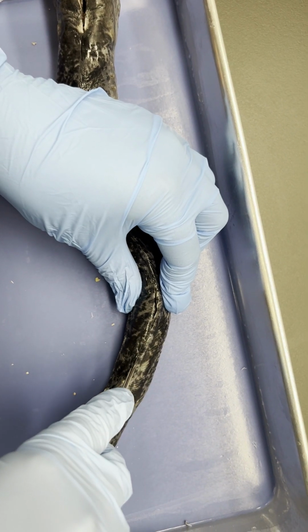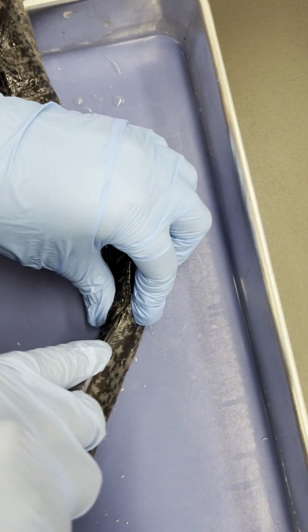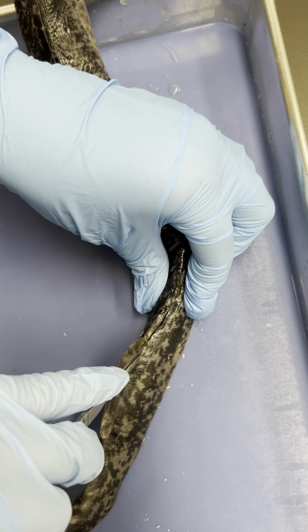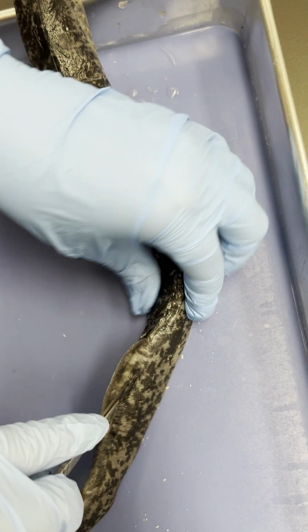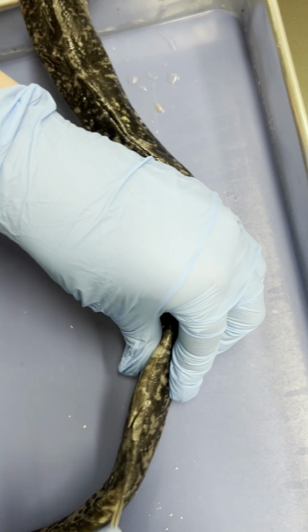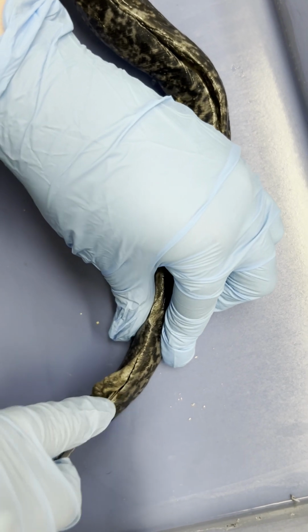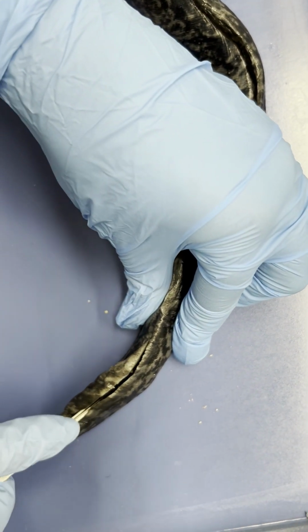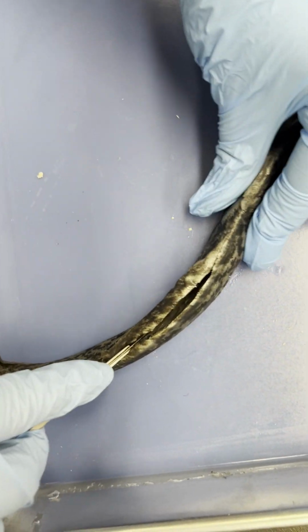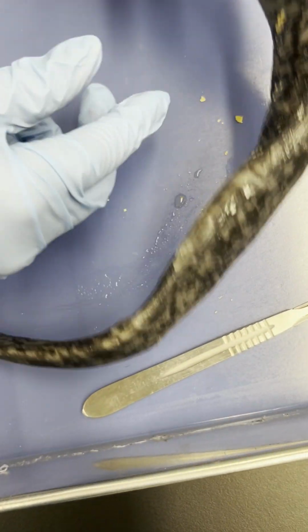We're working our way towards the back. I'm going to reposition our friend again. Hopefully this will be a good cut. I'm hearing a crunching. All right, and we should be about past the cloaca here. So at this point, we don't need to worry too much about the tail region. So let's see what we got.